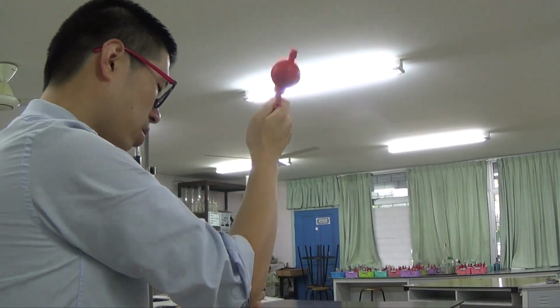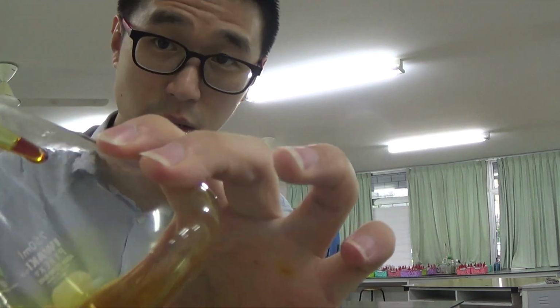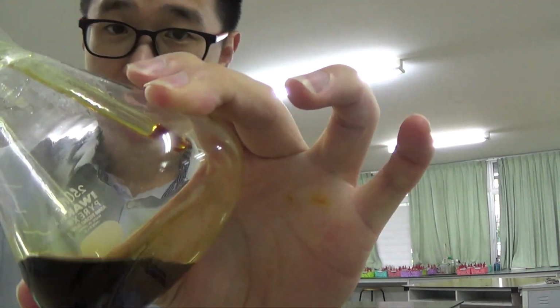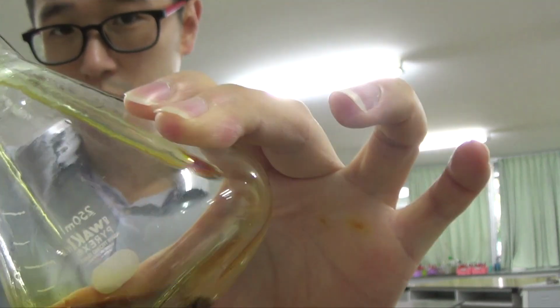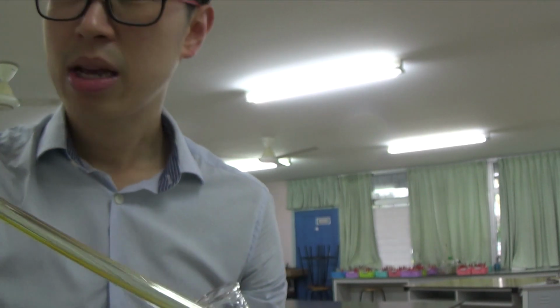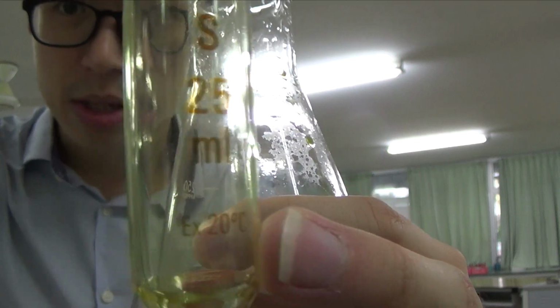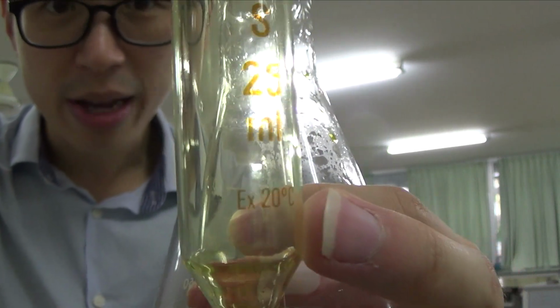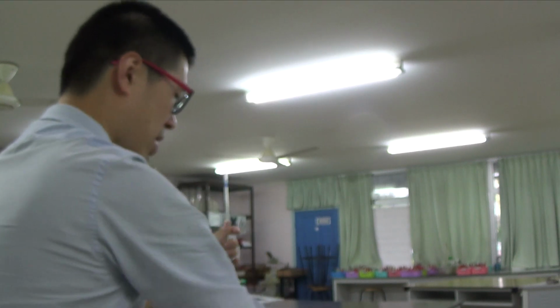Then you take out your pipette filler. This thing is brown in solution, so you see a little bit of droplet at the end there. You're not going to get everything out, but tapping very gently, 1, 2, 3, 4, 5, 6, 7. You're still going to be left with like one drop at the end. That is taken into account by the level of accuracy of the apparatus. As you could see, it's a plus minus something. That is alright.